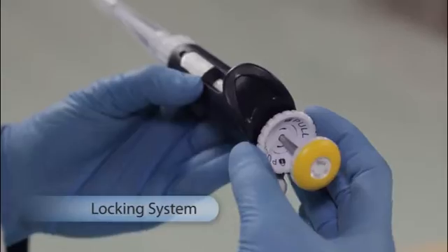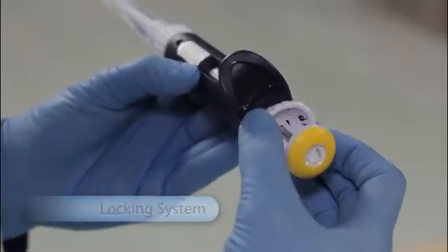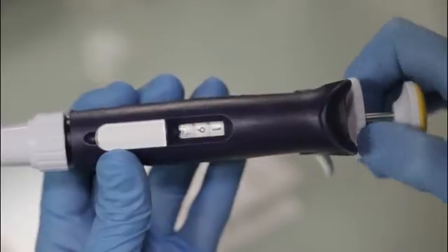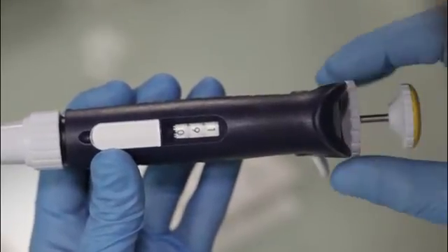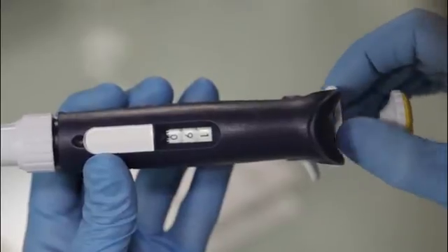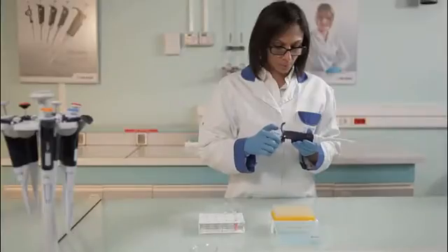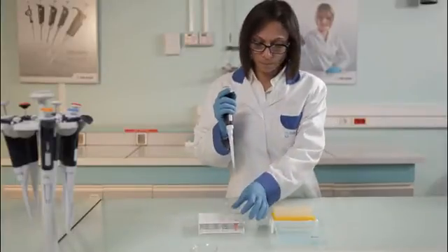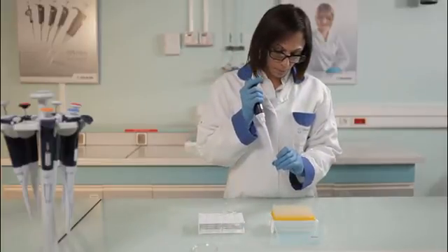A lockable volume system guarantees secure pipetting. It is easy. Just push the thumb wheel up, rotate it to change the volume, and push the thumb wheel down to lock it. Once the thumb wheel is locked, the volume won't change. You can now start pipetting with complete confidence in your results.